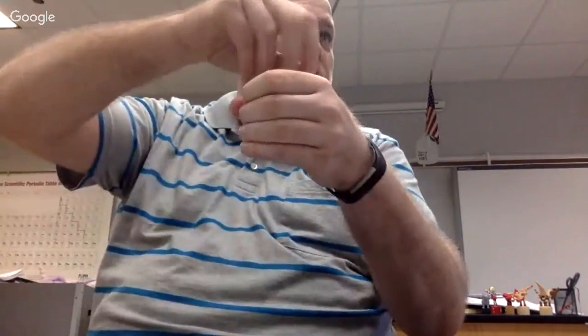Now, in order to help you with this, when you're using your dropper bottle, if you have it open, be holding onto the dropper bottle with one hand while you're dispensing it, and then close it back off. Don't do that salt and pepper trick where you just put the cap on so someone will grab it and shake it and it all pours out. Screw it down if you don't have it in your hand. I've never seen an open container just sitting there without a hand attached to it.